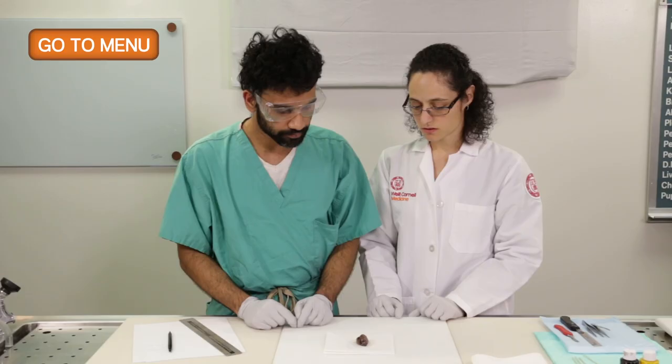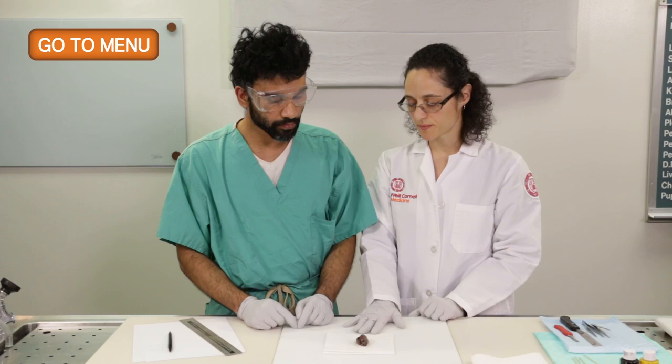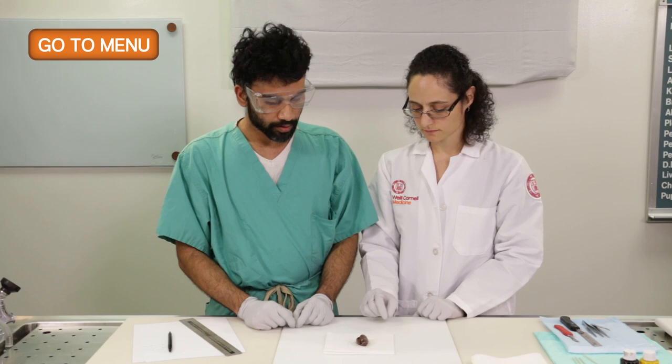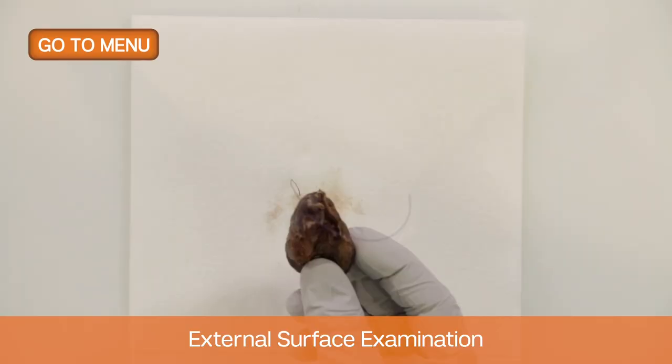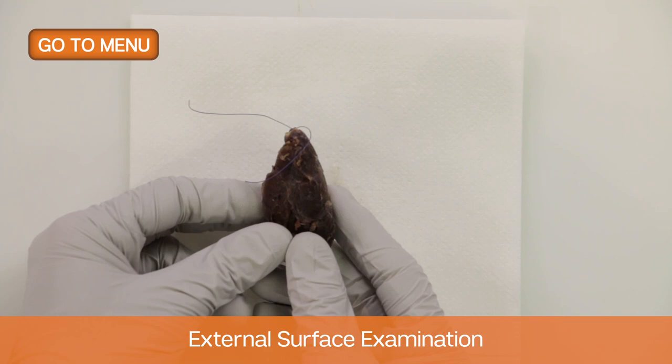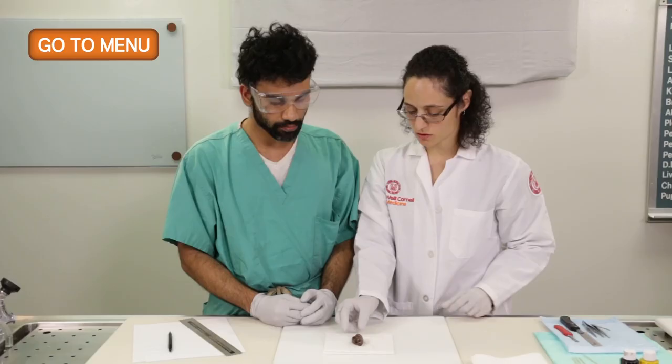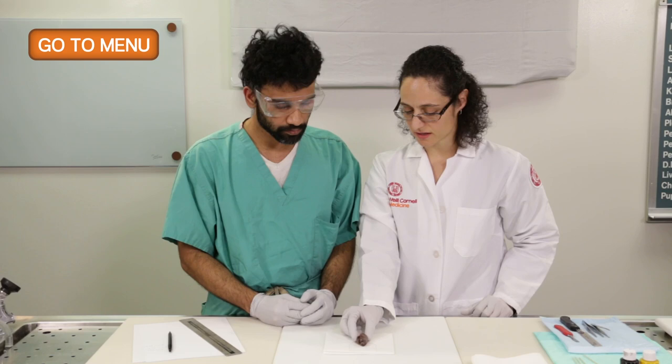So we've gone over orientation of the specimen, and taking measurements. One thing we didn't do yet is weigh the specimen. It's always very important to weigh the specimen. So we would take a weight. Once we take the weight, the next step is to start inking it? Before we ink it, we want to examine the surface of the gland for any kind of abnormalities or any attached soft tissue. Sometimes it will be skeletal muscle, or there will be fat attached near the isthmus, which may contain lymph nodes. So you want to look for any of that before you ink it.